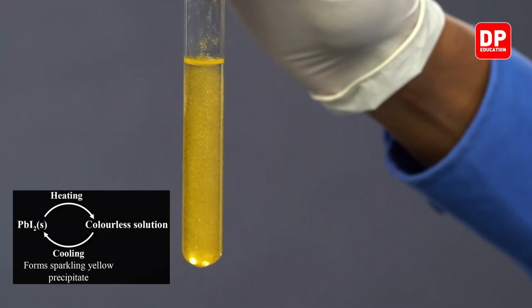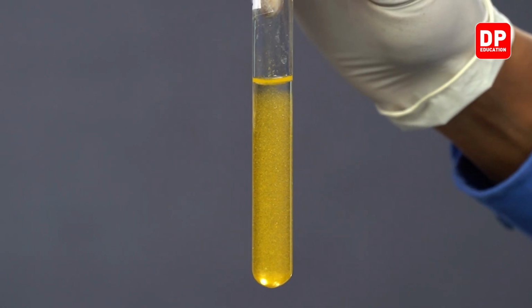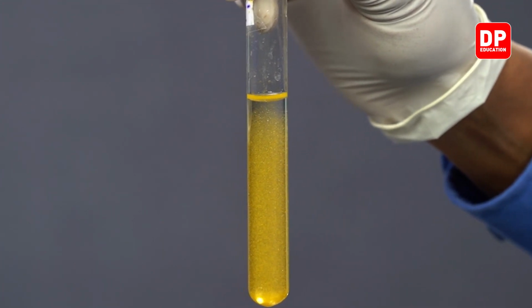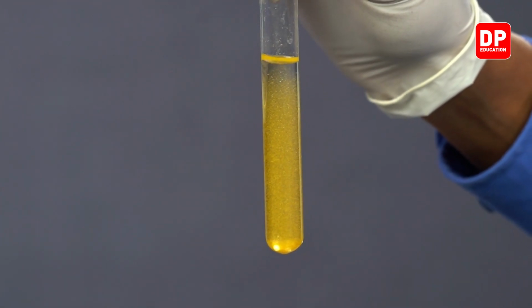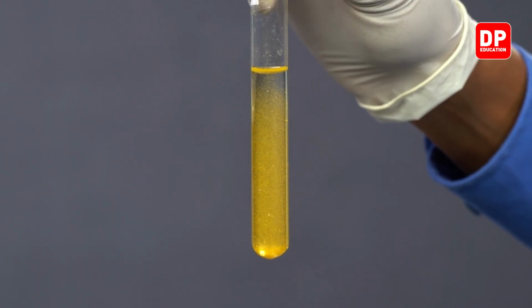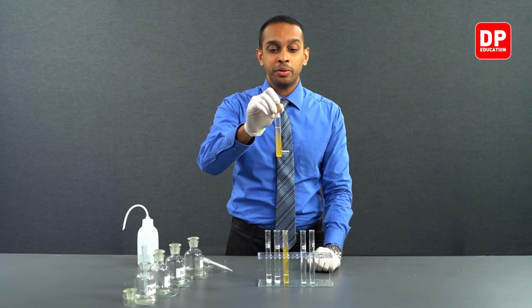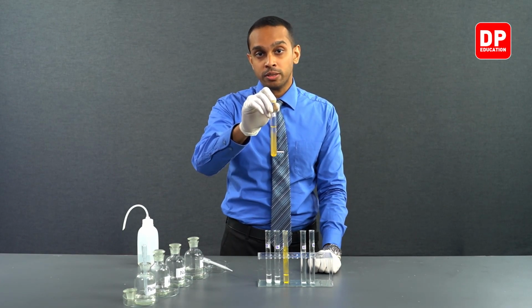due to the formation of lead iodide precipitate. Now, lead iodide has a glistening effect on it, right? If you are not sure whether the camera can capture it, the fine particles that are reforming upon cooling down, these fine lead iodide crystals have a small glistening effect, which gives it a gold dust color. But this is lead iodide solid being formed when you cool down the lead iodide solution that was formed with hot water.